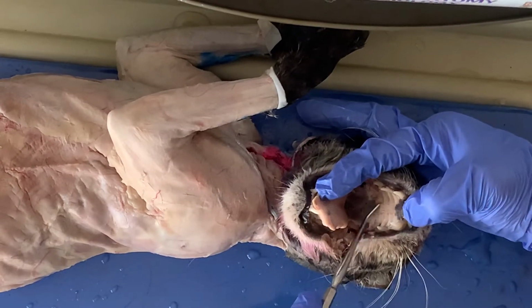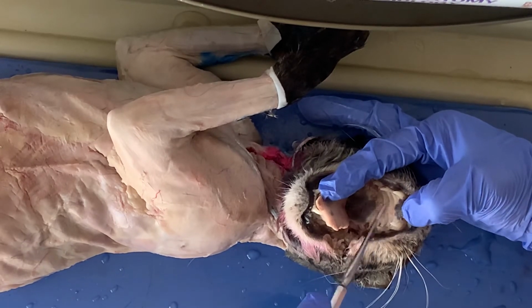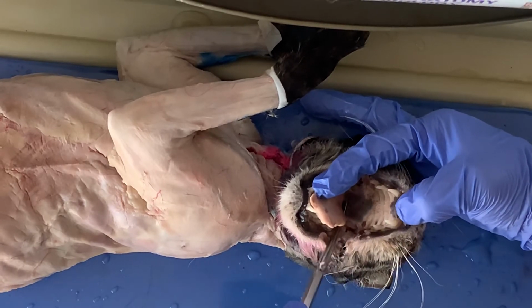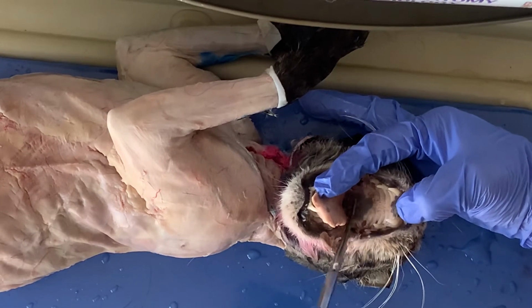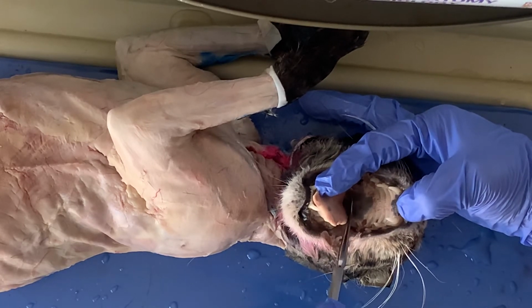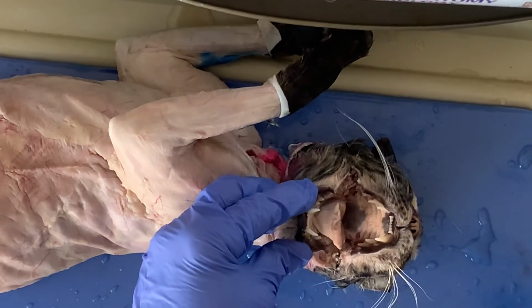And then the very roof of the mouth is broken into two sections. There's the hard palate right here, which looks rough and bumpy. It's ribbed like that. That's because the bone is right above it, and so that's why they call it the hard palate. And then as soon as it gets soft and squishy farther back, it's smooth, and that's the soft palate. So we have the hard palate and the soft palate, and then the soft palate for us has that little uvula hanging back there, which helps us during swallowing so food doesn't go up into our nasal cavity. But those are some of the special structures of the mouth.